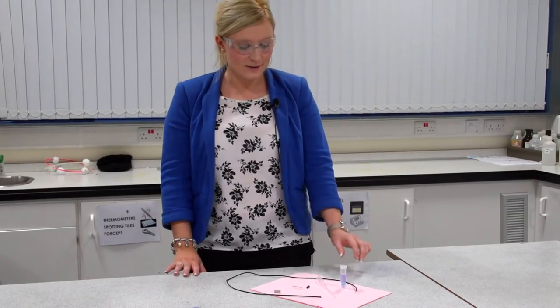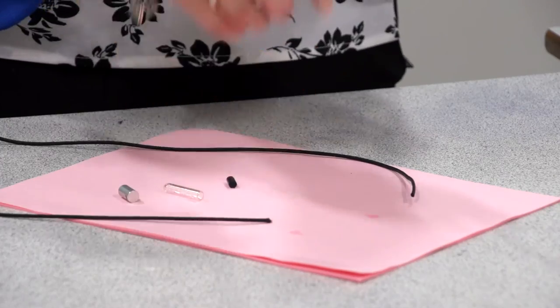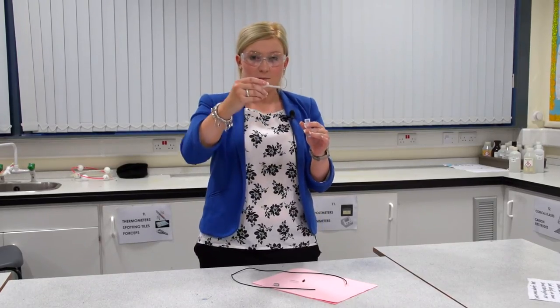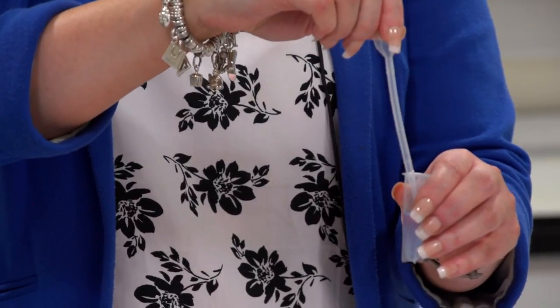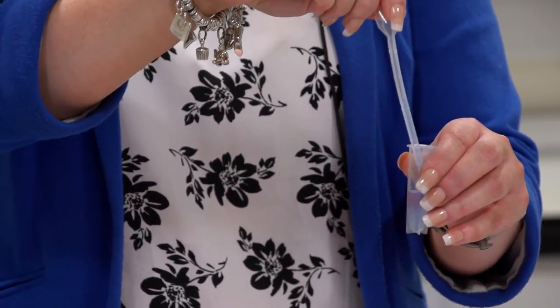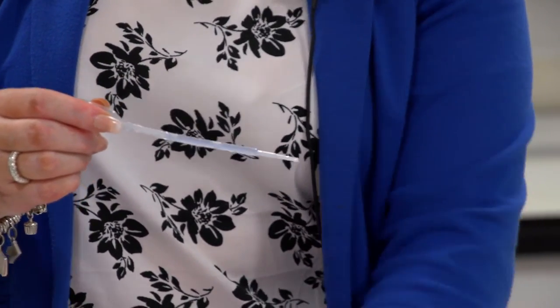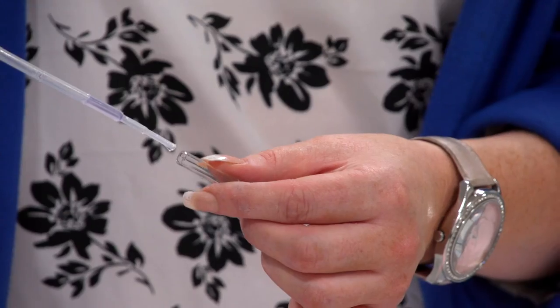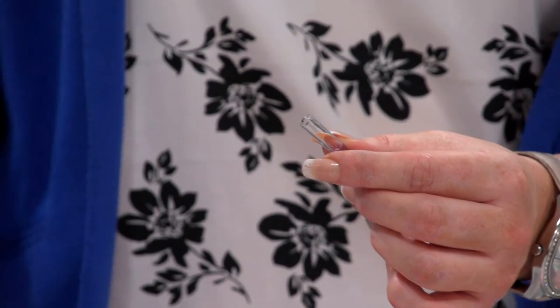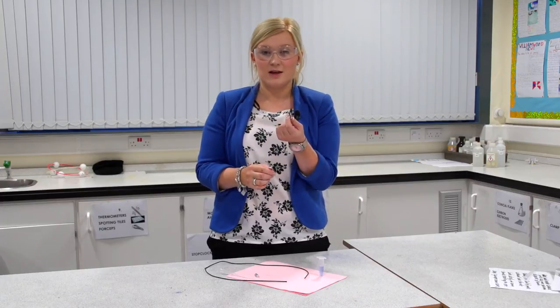Once you've completed your DNA necklace, your teacher will apply some super glue to your vial to ensure it remains intact. To make your DNA necklace, remove your strands of DNA from the purple layer of your vial using a fresh, clean dropper. Squeeze the top of the dropper, place it into the purple layer of your solution where you can see the DNA strands, and slowly and carefully extract the purple solution and the DNA strands into your dropper. Then place your DNA carefully into your glass vial and place the rubber stopper on top. Take this to your teacher and he or she will apply some super glue.